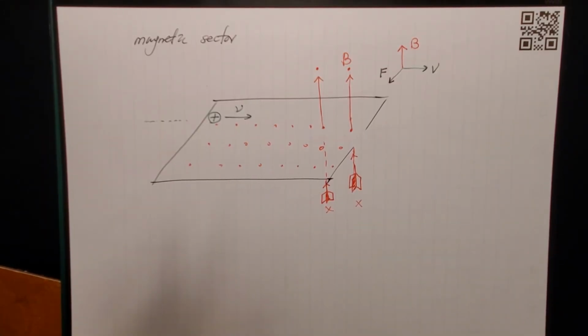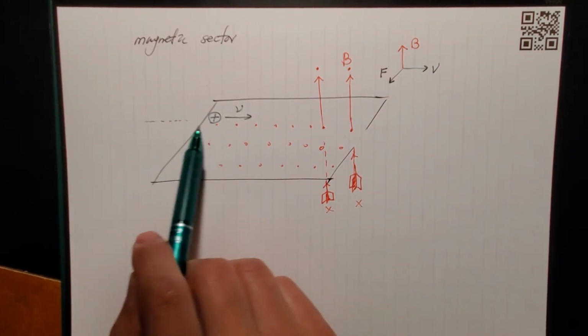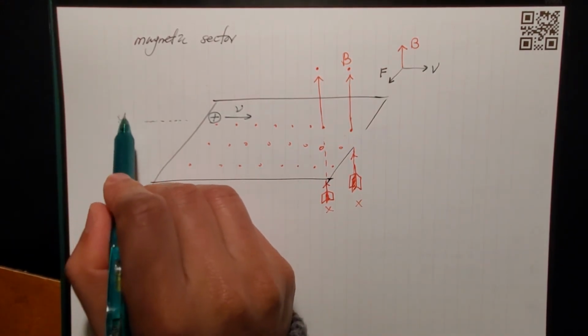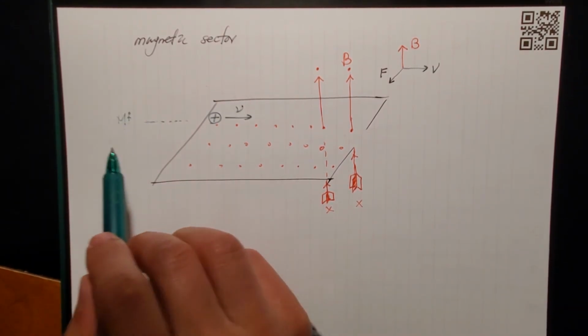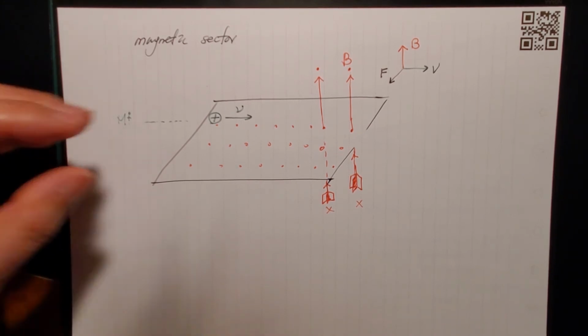All right, let me briefly go over the magnetic sector, how it works, the principle of it. In the ionization chamber, whatever the ion source was, ion spray, MALDI, whatever, right? The molecules first get ionized by losing an electron. Then some of them will start to get fragmented. Then many different types of ion come in.